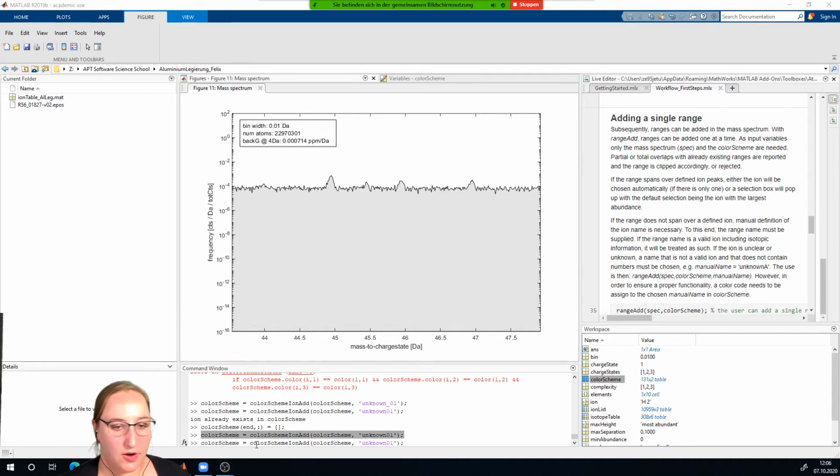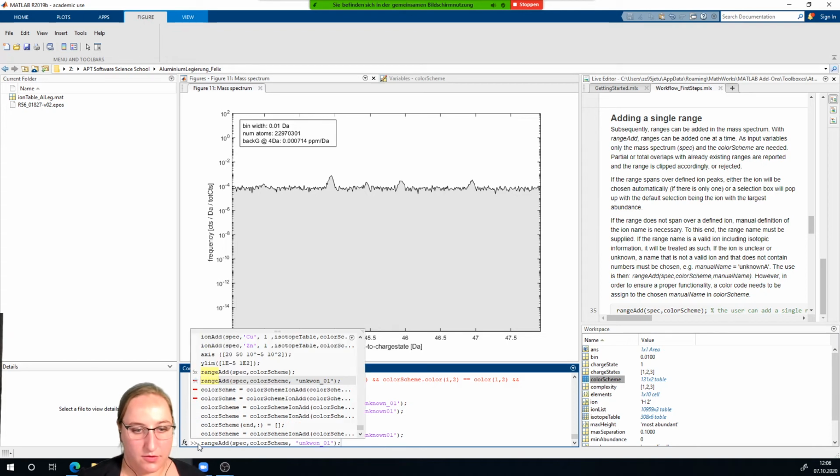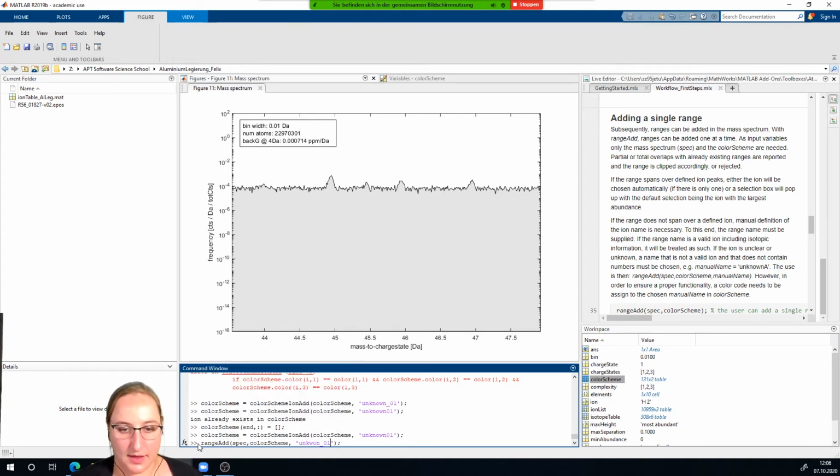So, okay, but without the 01, sorry. Okay, and then we range add, and then we give it the same name.